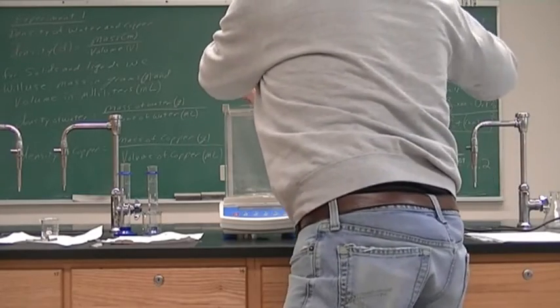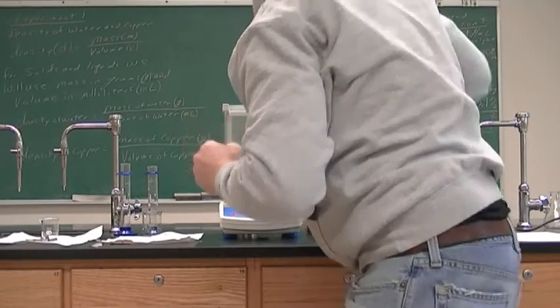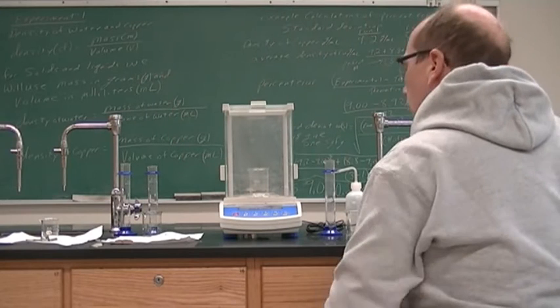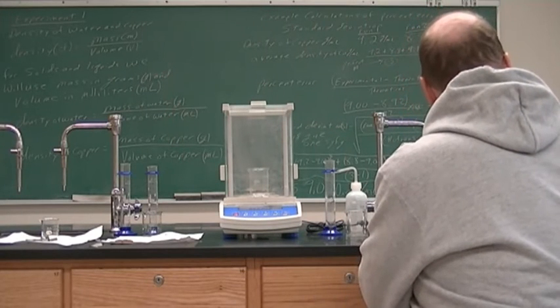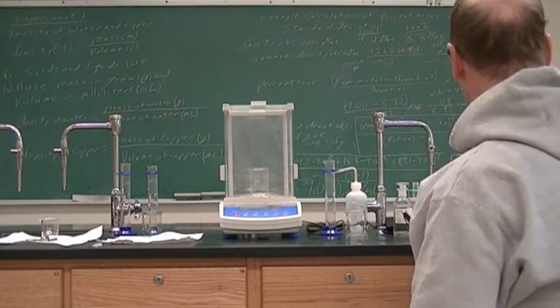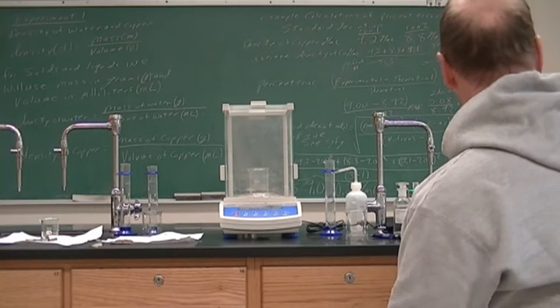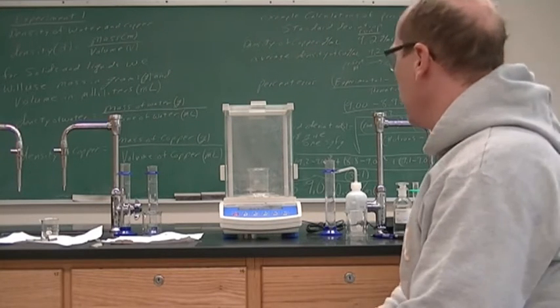And so I'm putting that back on. It's at zero now, and now it reads 86.5056. So 0.5056. 86.5056.